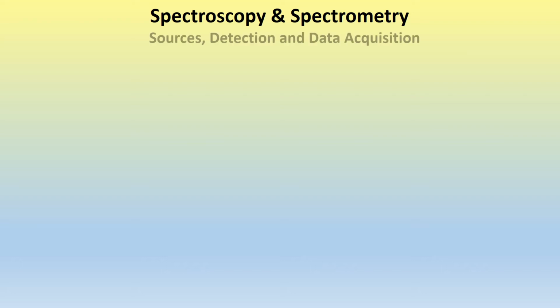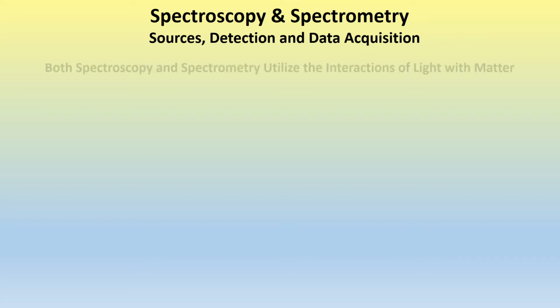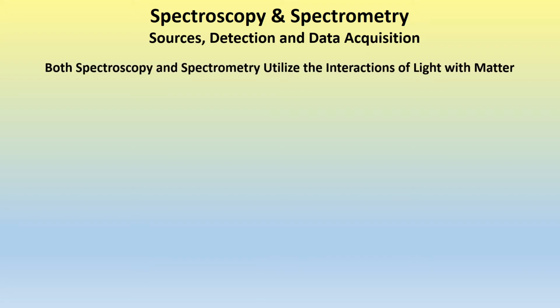Spectroscopy and spectrometry, sources, detection, and data acquisition. Both spectroscopy and spectrometry utilize the interaction of light with matter. In spectroscopy, photons of light are absorbed.